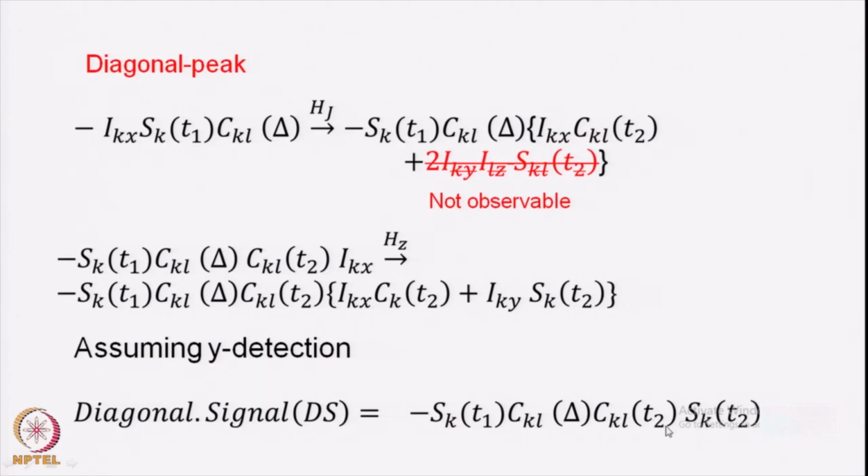Okay. So now we notice that during the T1 period I only have the chemical shift part, the SK, and there is no coupling, because the coupling part is evolving for a constant time, and therefore there is no modulation of the signal due to coupling evolution during the delta period. Therefore, this will only appear as amplitude modulation of the signal detected, whereas the T1 dependent term results in a frequency.